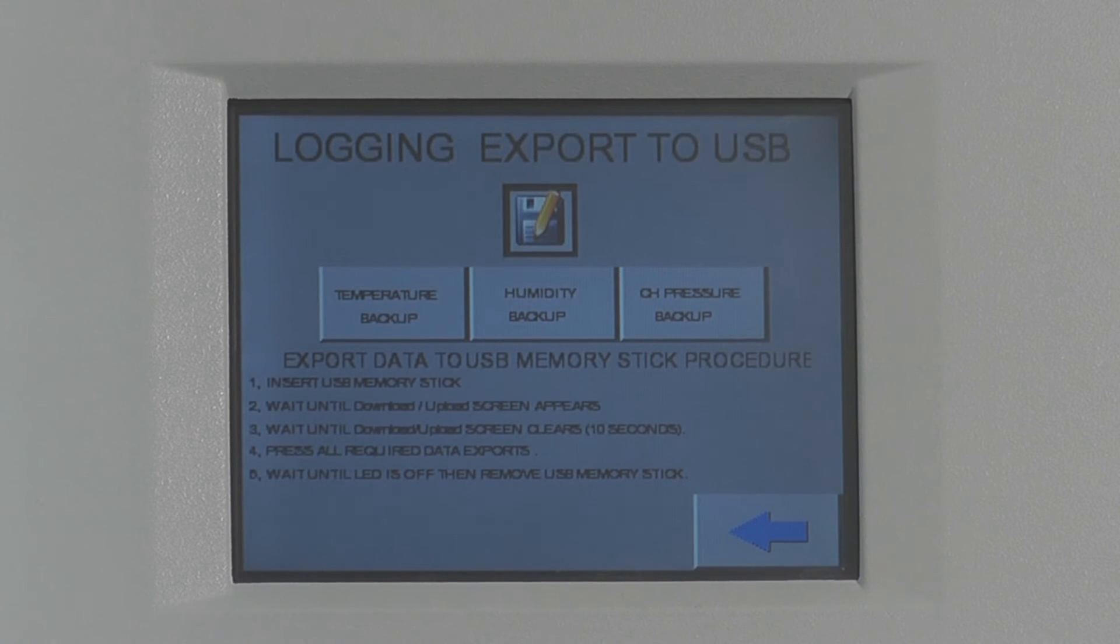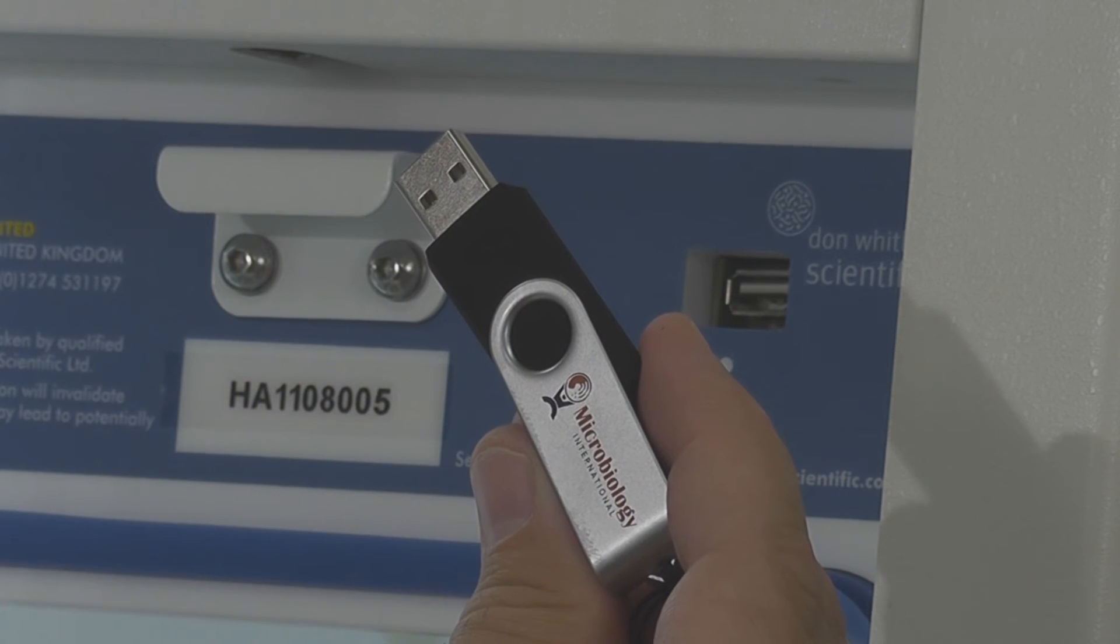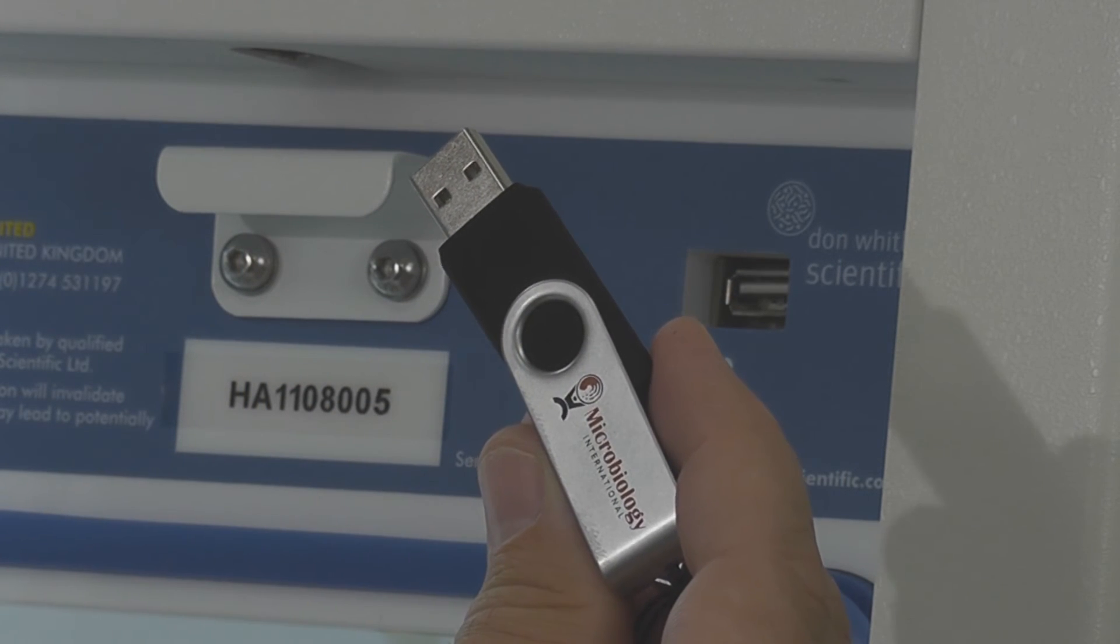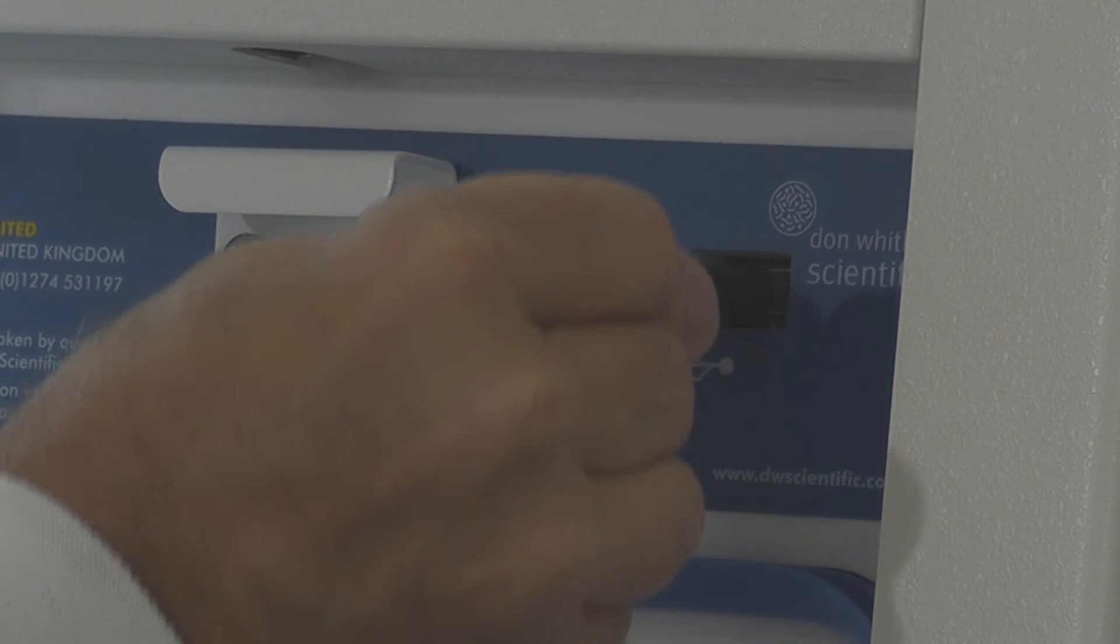You can easily download stored temperature, humidity, and internal pressure parameters over the last 30 days via any standard USB flash drive.